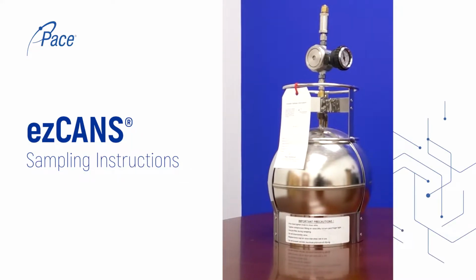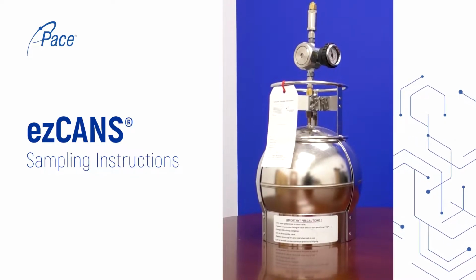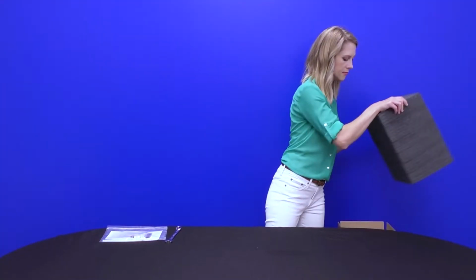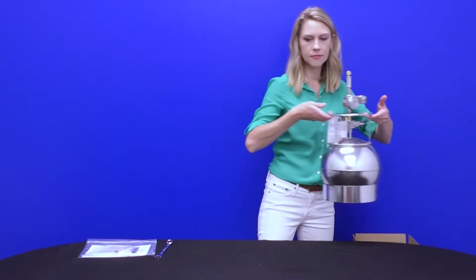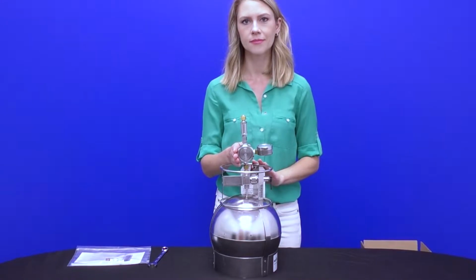Pace ezCANs are completely pre-assembled, leak-checked, and ready to go right out of the box to help ensure you have a successful sampling event. Open the box and remove the protective ezCANs foam insert and set it aside for return shipping. Be sure to lift the ezCAN by the frame ring near the top of the canister. Avoid lifting by the flow controller or any part of the sampling assembly.